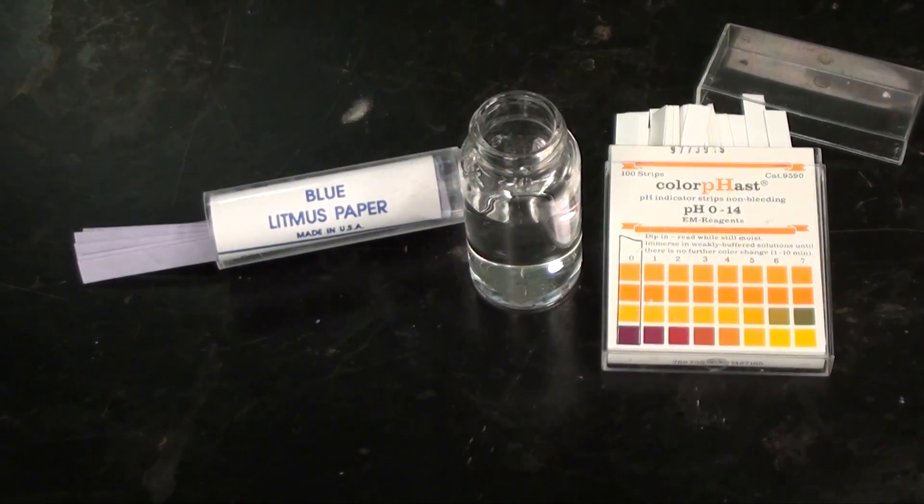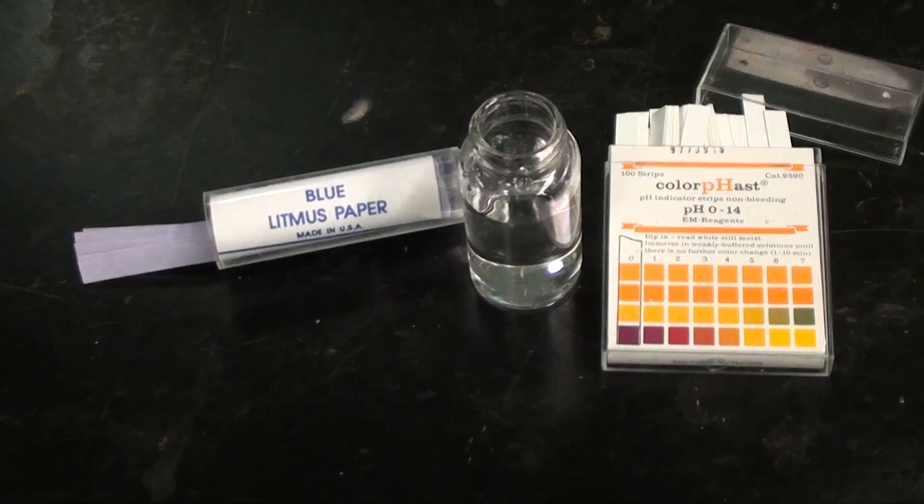Now there are a few ways to measure pH. The cheapest, simplest and most reliable is pH paper.